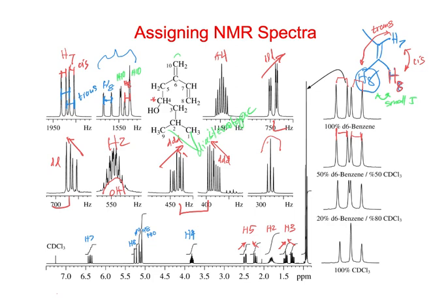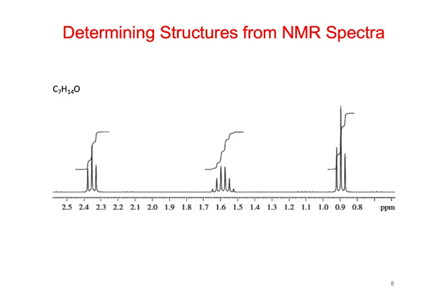All right? All right, so let's just look at some other simple ones here. This gives us a molecular formula, and there's just 3 peaks.